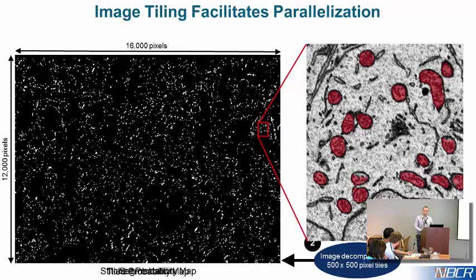Then, see how well it did, and maybe rerun it on a binned version. Because at that point, there's no cost to you, really. You've already done the segmentation. At that point, it's just running the job through the portal, to see how it did at bin 2, or downsampled by 2. Again, you can quantify it or eyeball it to see. So usually when I'm approaching a new project, I'll do that sort of experiment at the outset to see what I can get away with. And it's worth it because you're talking about, you know, potentially saving many CPU years of computational costs by just running that simple experiment.